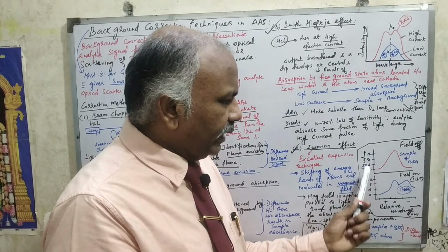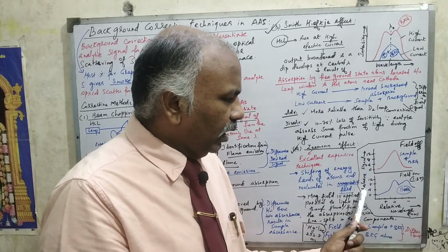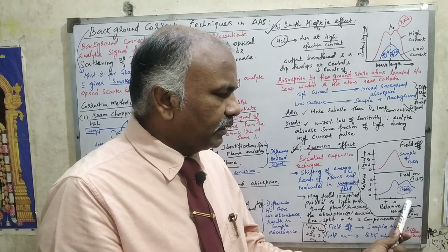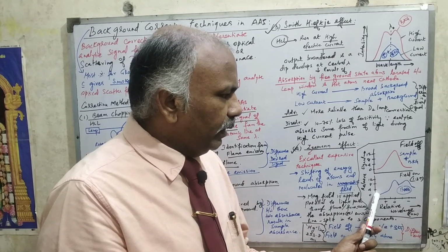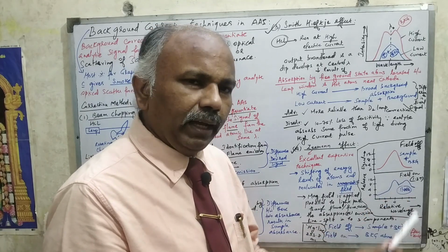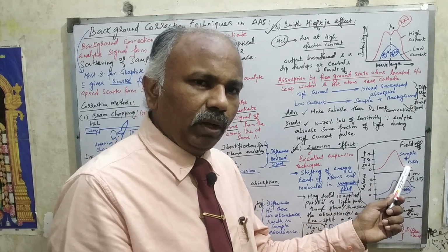So now I can show the example here. I put the relative wavelength in nanometers on one axis, and on the y-axis I am putting the relative signal. And here there is a zero line, here there is a positive, here there is a negative, right? Now what will happen if I put the magnetic field off? If there is no magnetic field, I will get the response for both the sample and the background absorption.